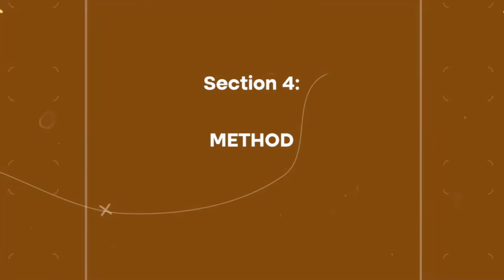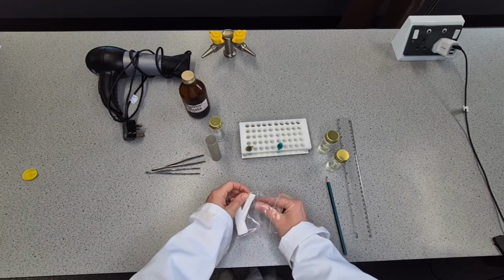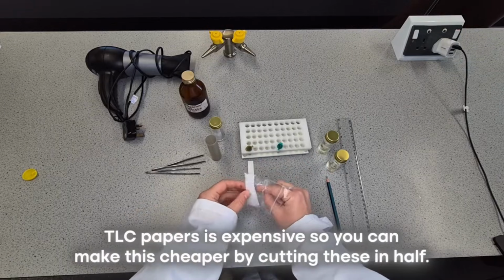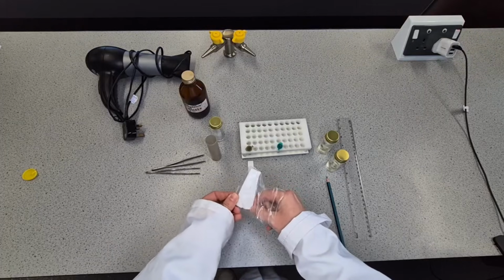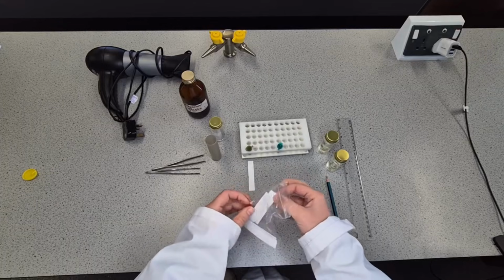So now we're ready to get on with our method, and I'm actually going to run 2 TLC plates, 1 for each pigment. TLC paper is expensive, so you can make this cheaper by cutting these in half lengthways, because that is still wide enough for you to be able to get a good chromatogram.